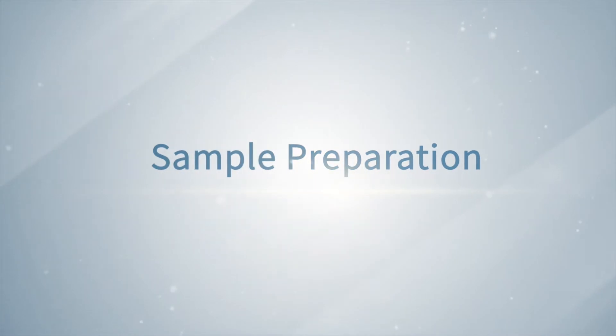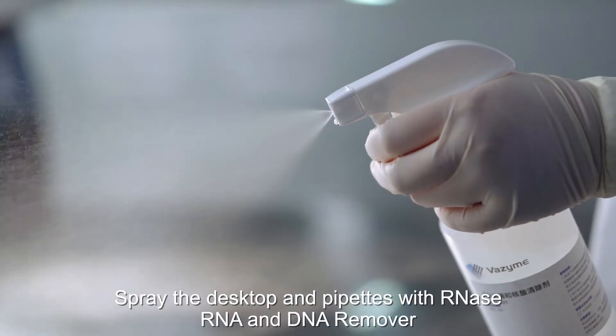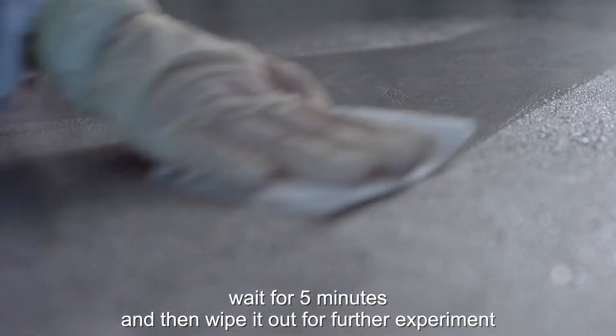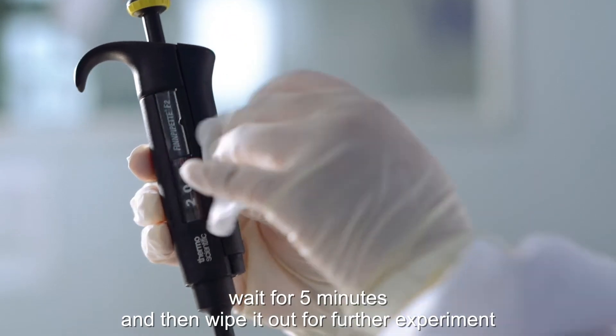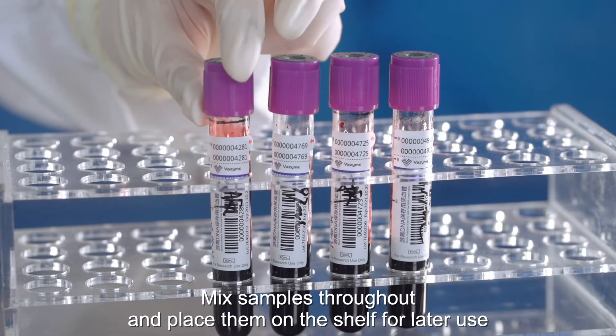Sample preparation: spray the desktop and pipettes with RNase, RNA and DNA remover. Wait for 5 minutes and then wipe it out for further experiment. Mix samples thoroughly and place them on a shelf for later use.